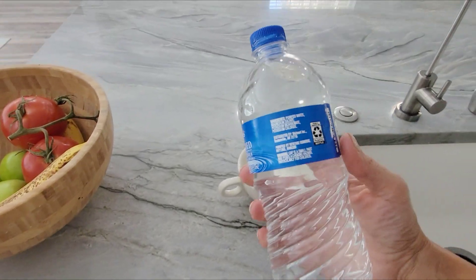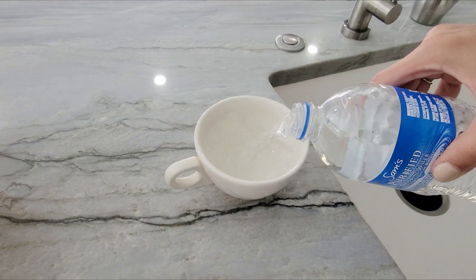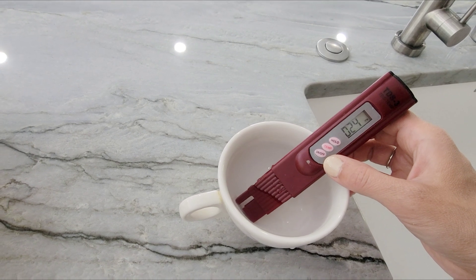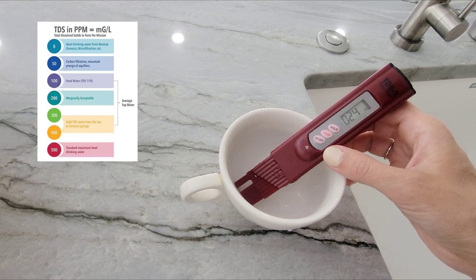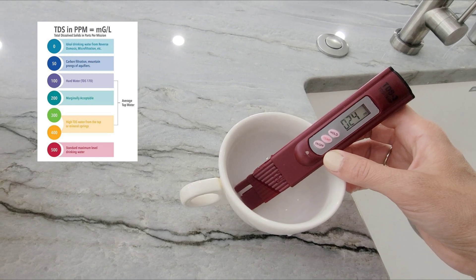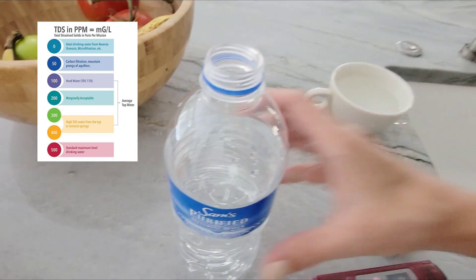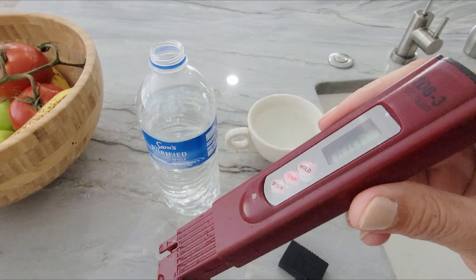Now I want to try this. 24. That's crazy. Wow. This is great drinking water. It makes me want to use this on all the water I find.